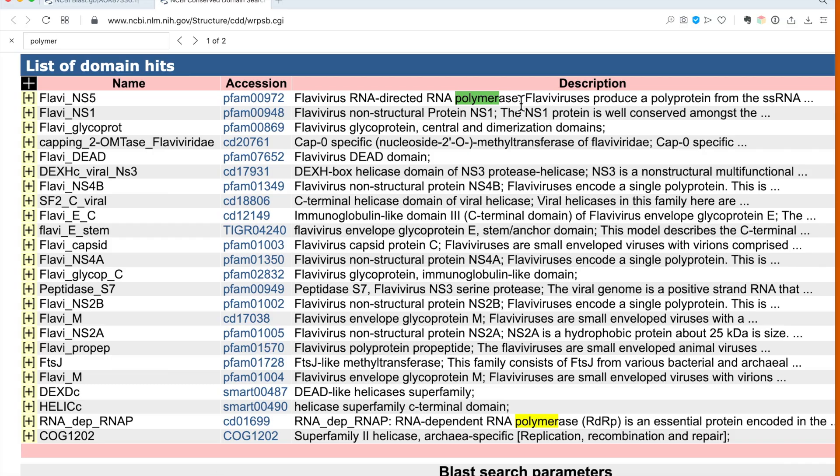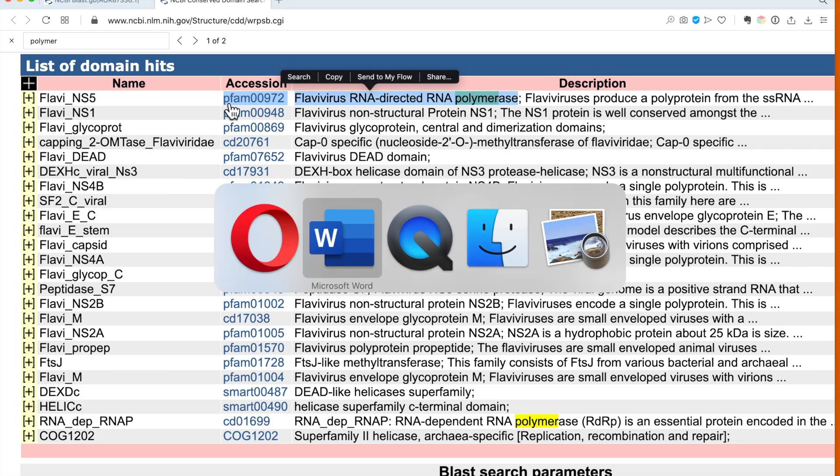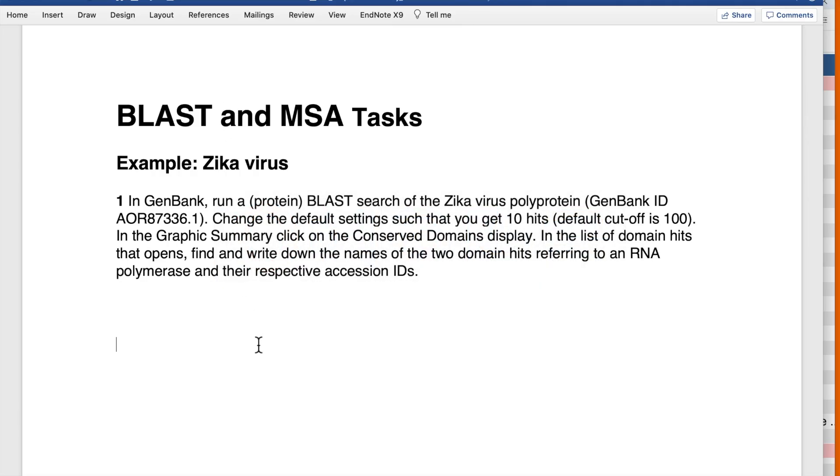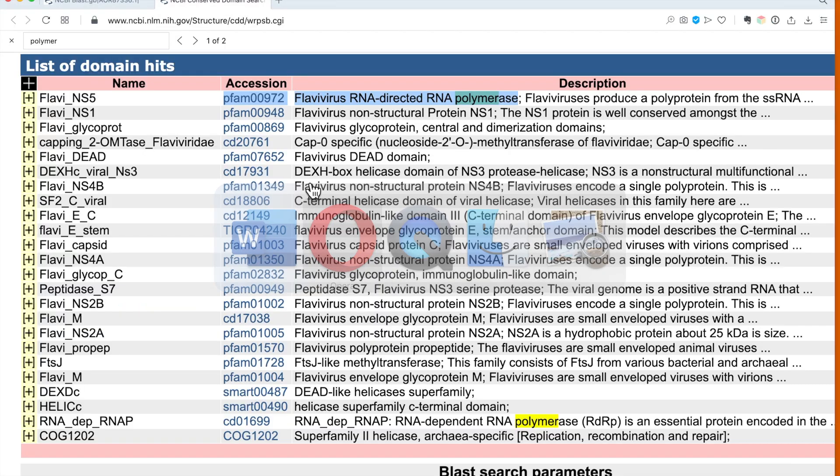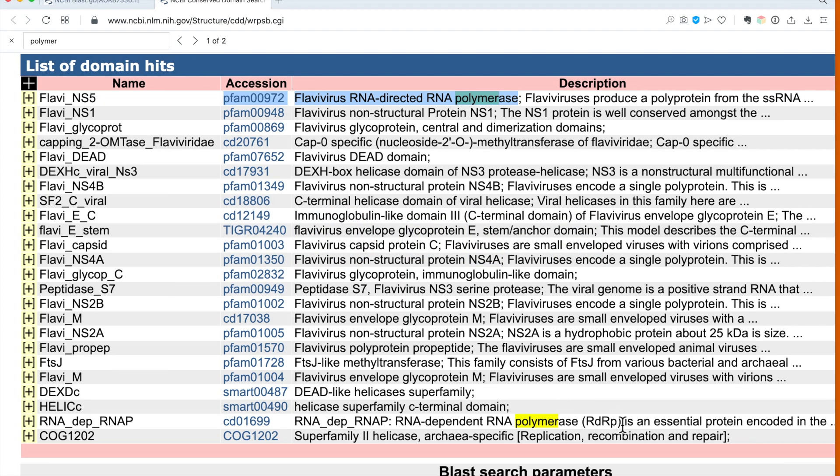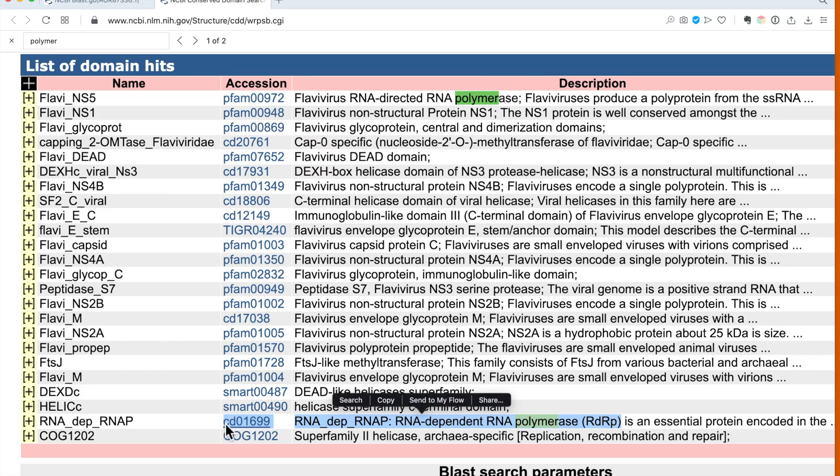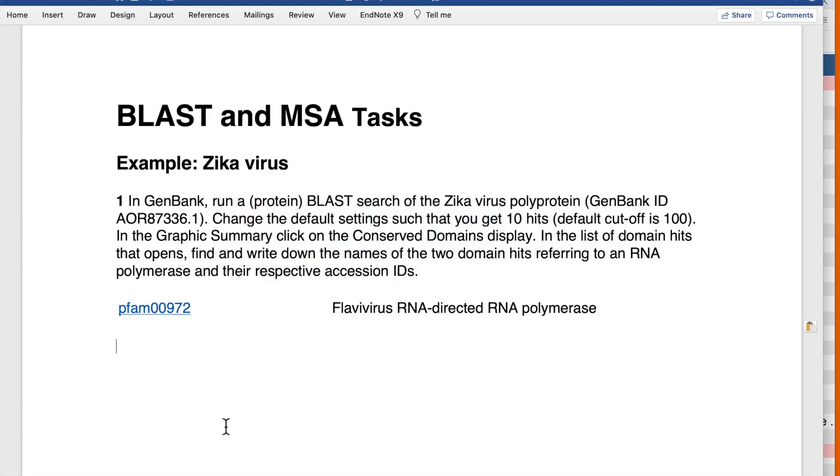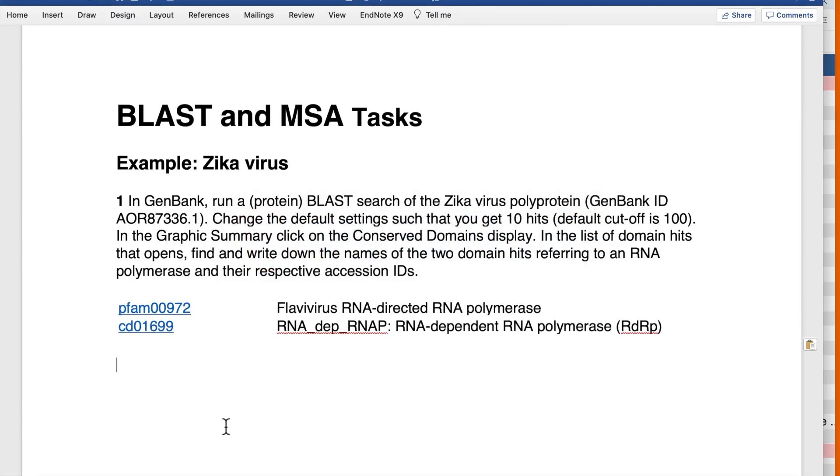For the results of the question we were supposed to do, I copy and paste the first one, go back to our domain hits, and copy and paste the second. Here we have our two results: first is Flavivirus RNA directed RNA polymerase, second is RNA dependent RNA polymerase RDRP. The first one is from the PFAM database and the second from CD, which is the conserved domains data within NCBI GenBank.